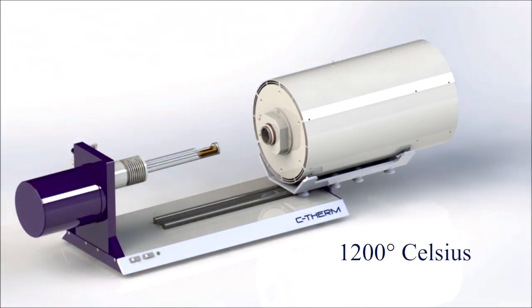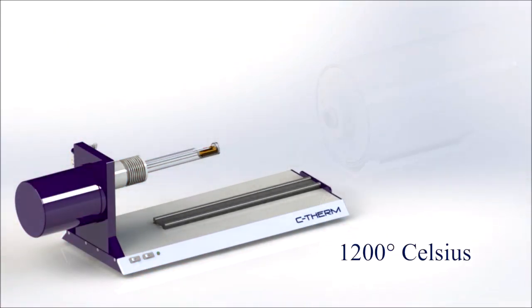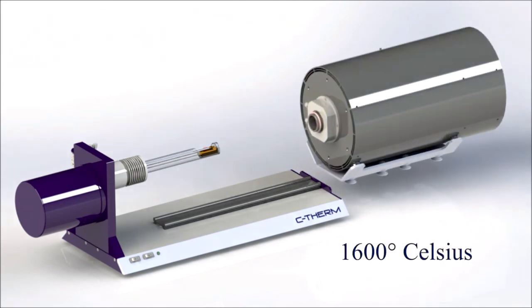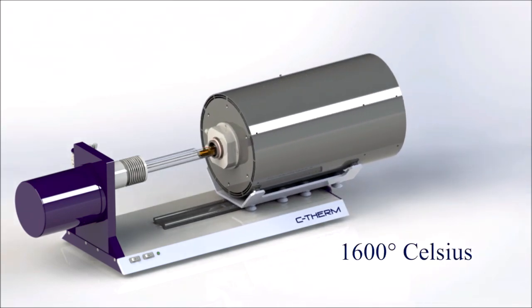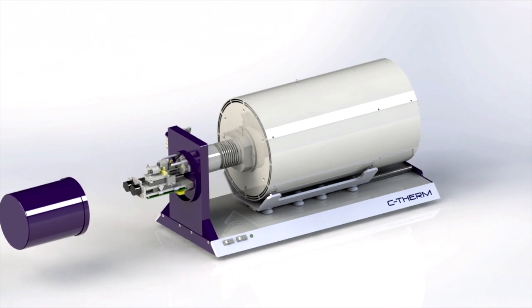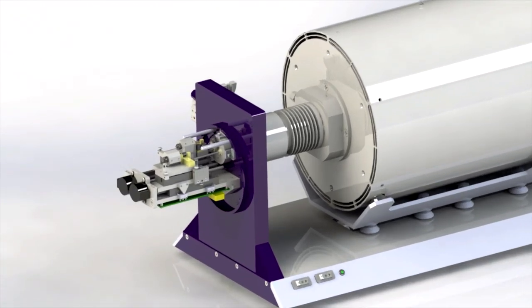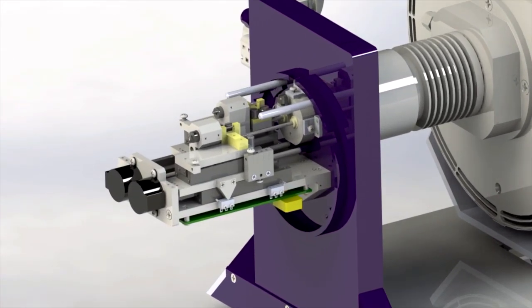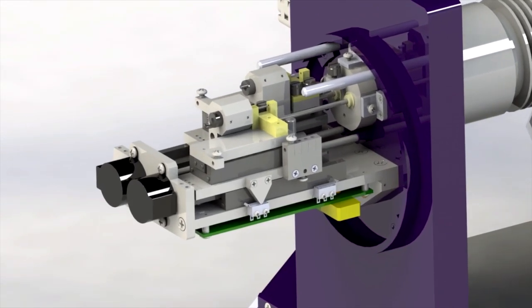The interchangeable furnaces, easily swappable and configurable to cover virtually any application up to 1600 degrees Celsius, and a thermally stabilized measurement head employing state-of-the-art LVDTs for precise dimensional measurements.